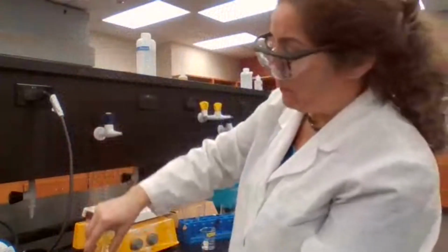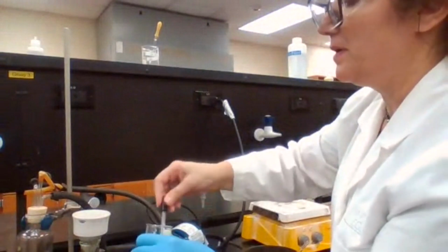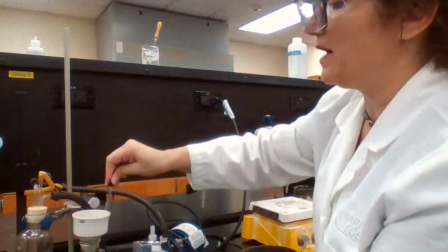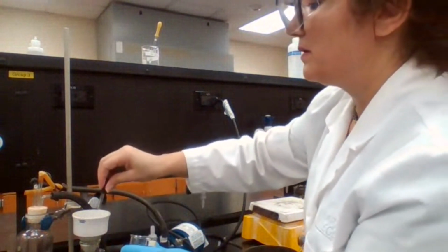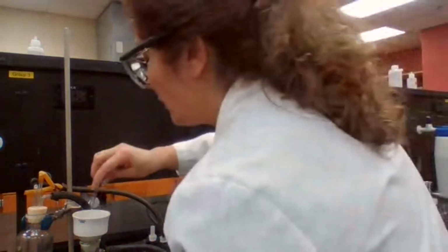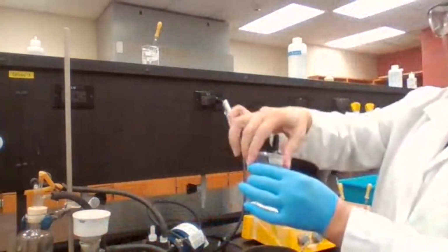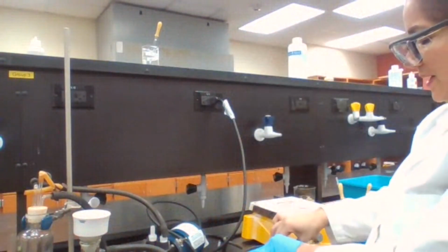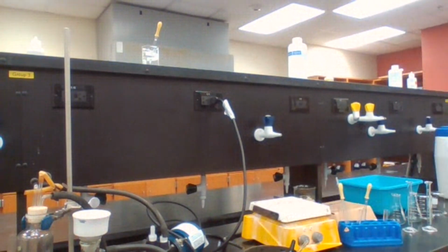Crystals are forming. I'm using methanol to wet the filter paper, because if I use water, then 70 degrees in the oven is not going to be high enough to evaporate the water. So I try to avoid any water. And I'm leaving the methanol in the ice bath to cool off, so when I wash the precipitate, I wash it with cold methanol rather than room temperature methanol.